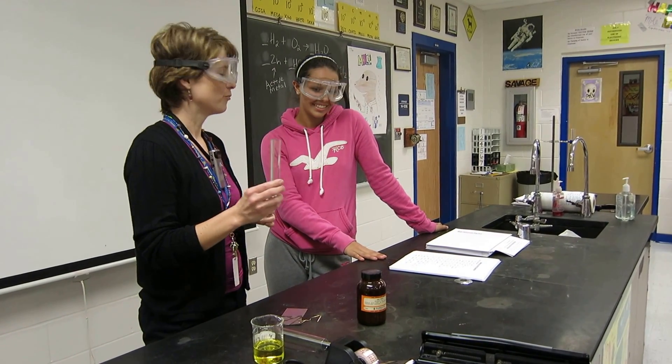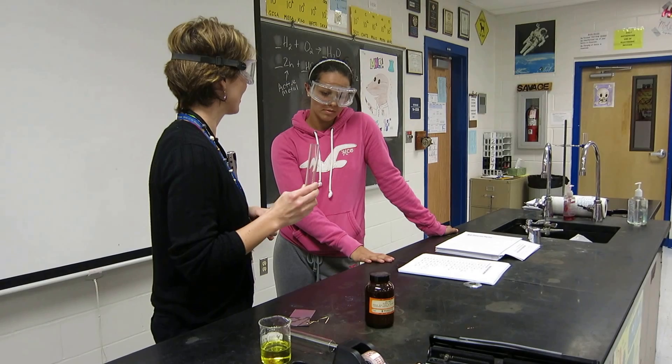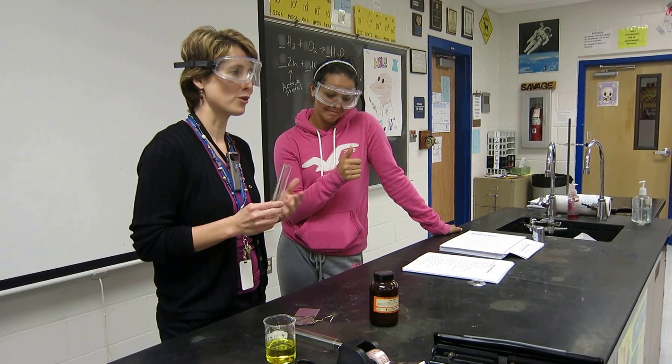We're going to demonstrate what happens when you add hydrochloric acid to zinc. So Ashton, thank you for coming up to help us today. Let's give Ashton a round of applause for being great.